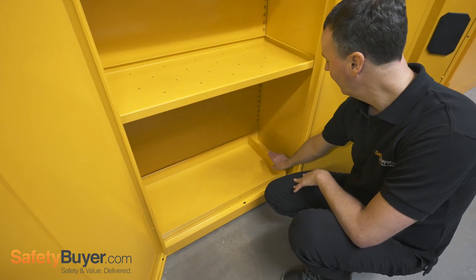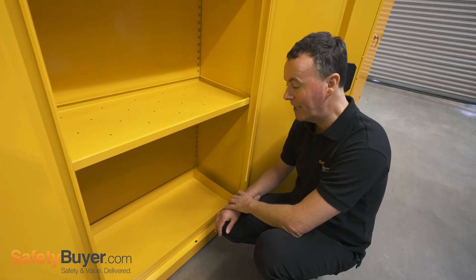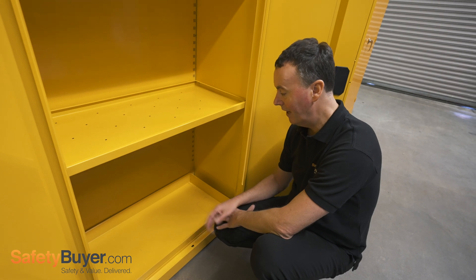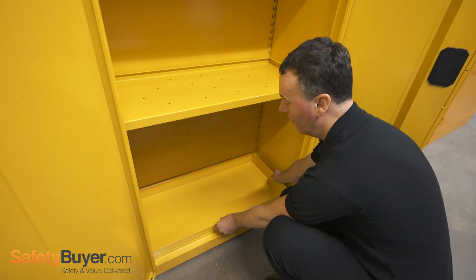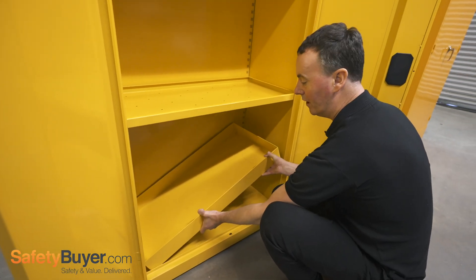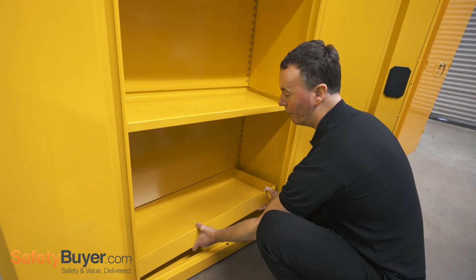It's actually removable, so there is a chance that with a spill in the base of the cabinet, rather than containing and cleaning up the spill here, you may be tempted to lift this tray out of the cabinet. With just a few litres, the angle you need to move the tray out does pose something of a risk.